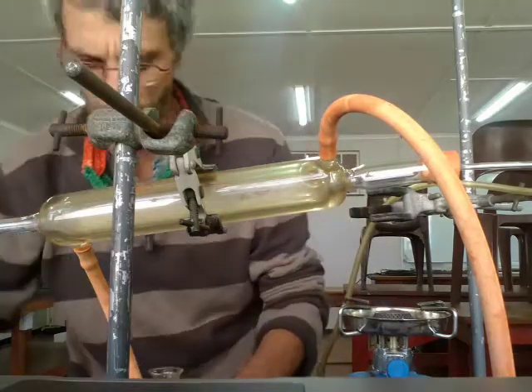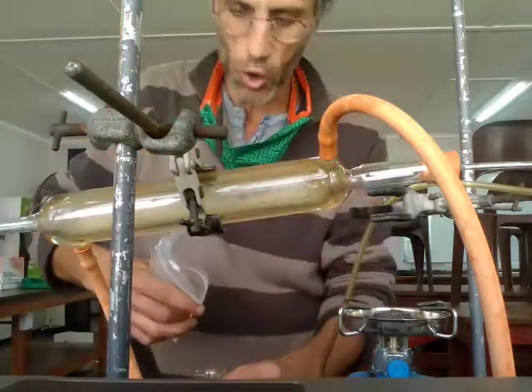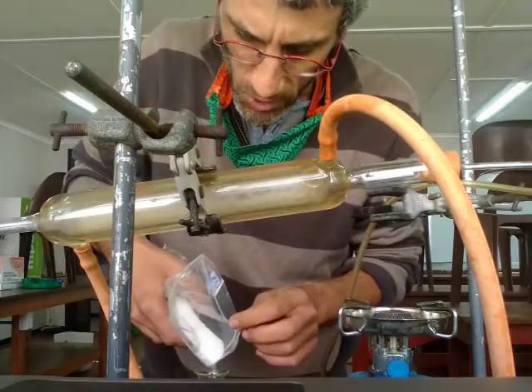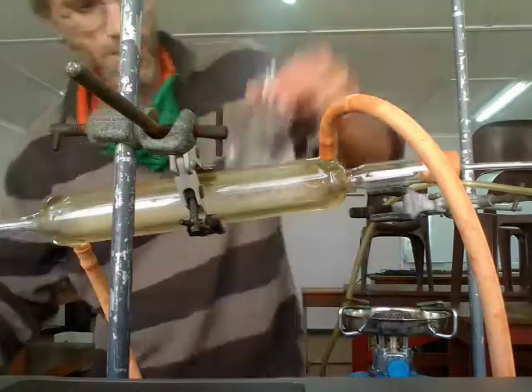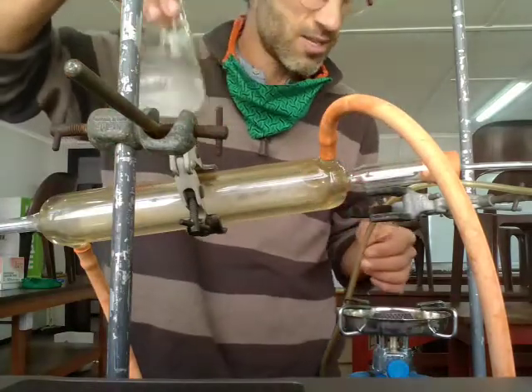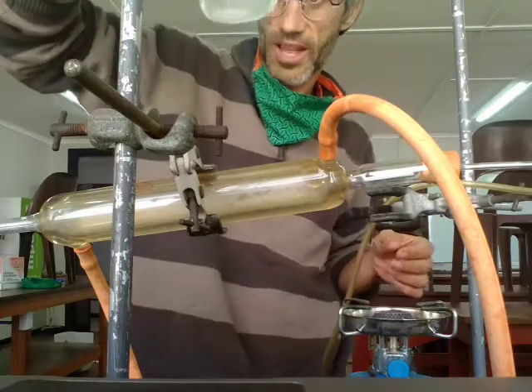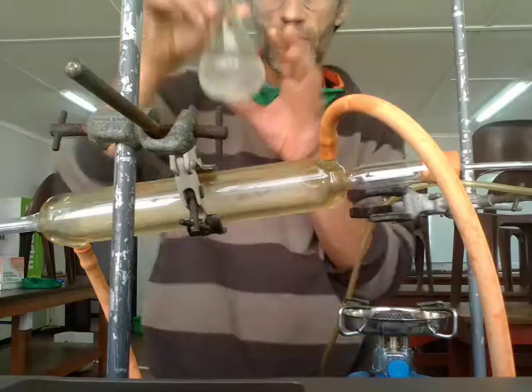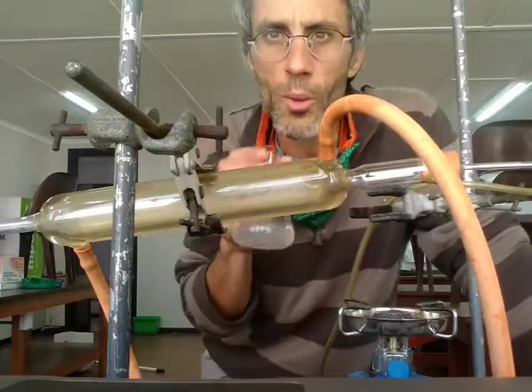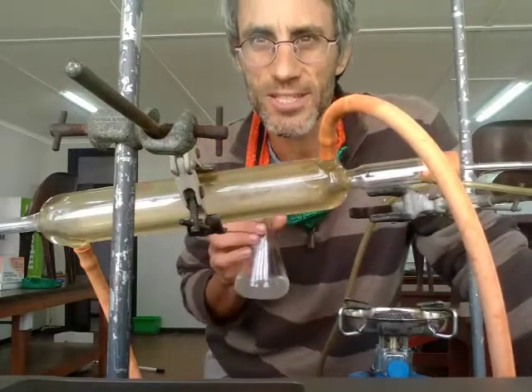Now I'm going to add a little bit of salt to this water. You can see there's salt here. Give it a little stir. If I was a bit more organized, I would have something to stir it with. But now I've got salt here. Salty solution.